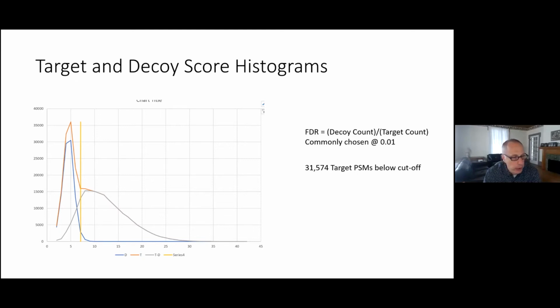With respect to quantification, we're just looking at MS1 intensity, and that does not feed into whether a peptide is identified correctly or not. We could be totally wrong about it. For instance, imagine that a peptide was not in the database we're using. For every spectrum we just give its best match, not the right match. So if the best match is a false positive and it's a super intense peptide, you can see how the MS1 intensity has nothing to do with whether that assignment was done correctly. It's really only the MS2 fractional intensity where that shows up, and that's only a partial factor. Is that helping at all? Maybe after I talk about the other intensities later, it'll crystallize better.